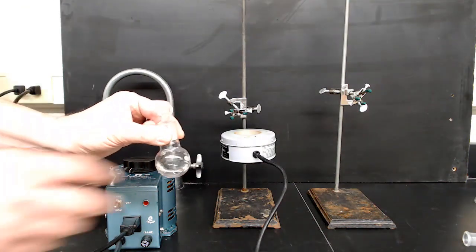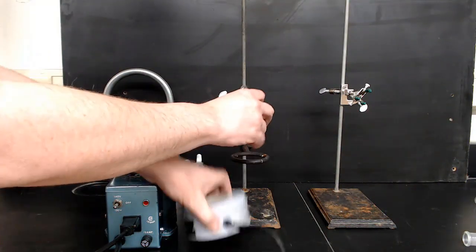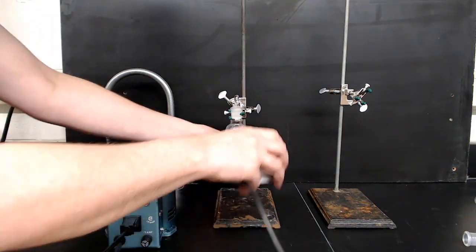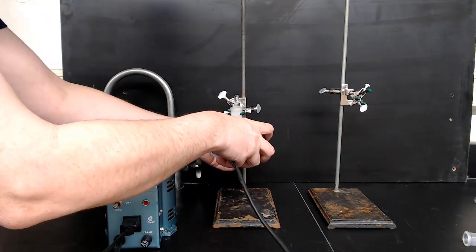Here's the flask we're going to distill from. Clamp that securely to the ring stand, and then put the heating mantle underneath, making sure there's firm contact between the bottom of the mantle and the flask.